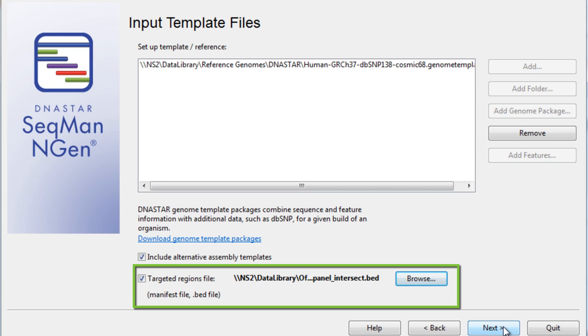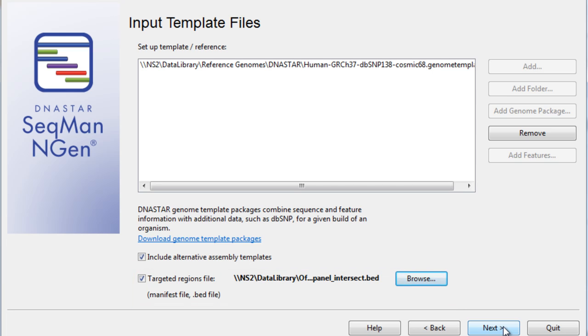For this validation control workflow, I'll use an intersected bed file, which was constructed using both the Genome in a Bottle high-quality region bed file and our specific target region bed file.